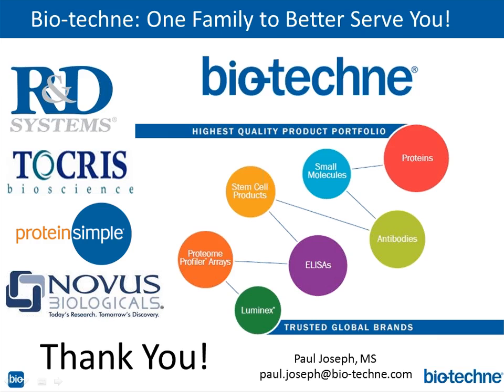So I'm sorry, I don't have more information on that, but I believe in a perfect world, most of the time TBST is used, and there are a few exceptions where PBST would be used, but I don't know the exact examples. I think just follow the protocols that are recommended for that particular antibody and that target.